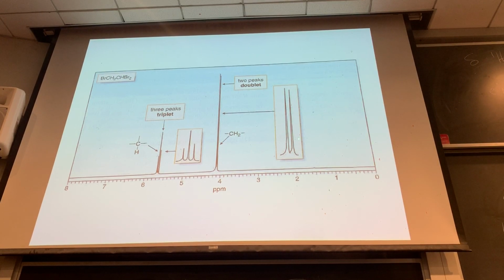And sometimes you blow these things up. So this is an inset of what that looks like. Sometimes you can't see them. The J value is very small. And there it is, this nice doublet, both adding and subtracting from the magnetic field due to the one neighbor there on that methine hydrogen.